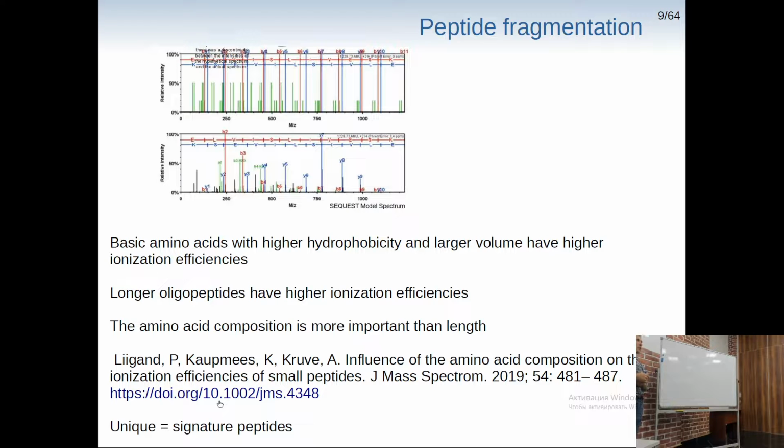Which one of them will be more beneficial for fragmentation, and why? What is the difference between those two modes of ionization, electrospray and MALDI, if we are talking about the ions that we get after this ionization?